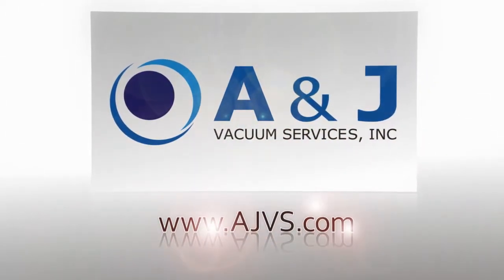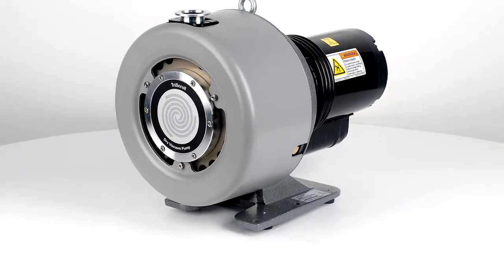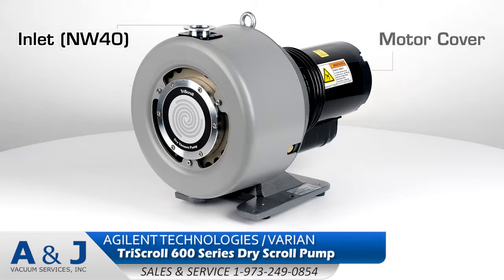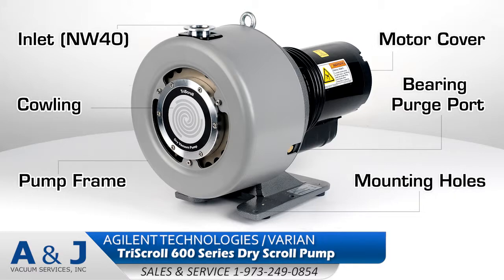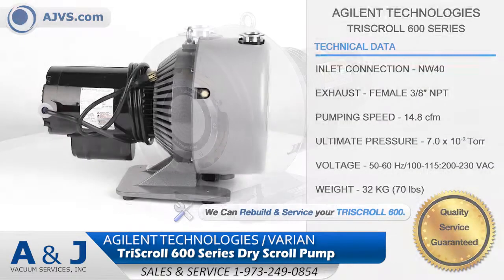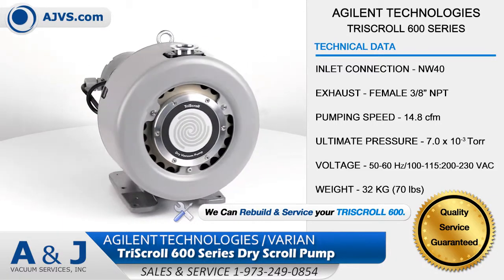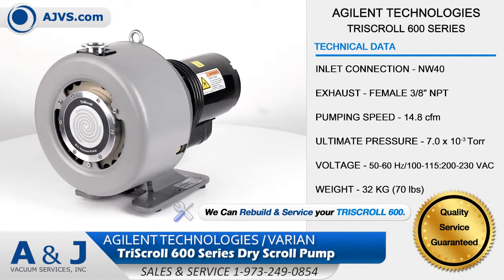AJVS.com, your worldwide leader of high vacuum equipment. The Agilent Technologies Tri-Scroll 600 is a multi-stage, oil-free dry scroll pump designed as a low-maintenance solution for a wide range of high vacuum applications.